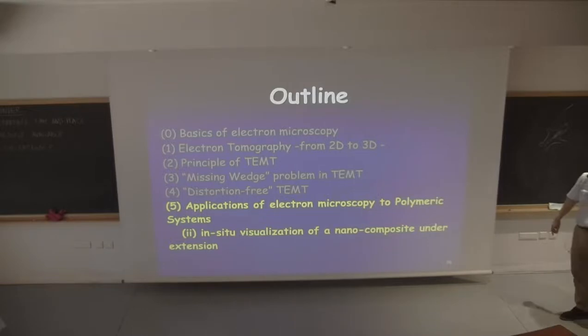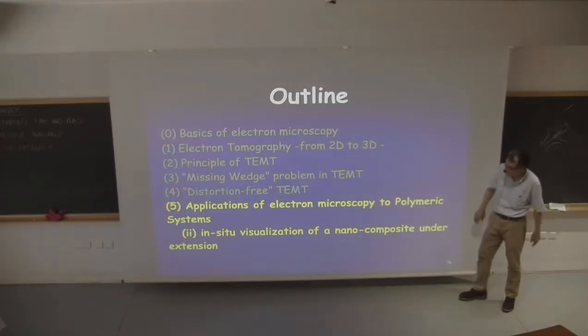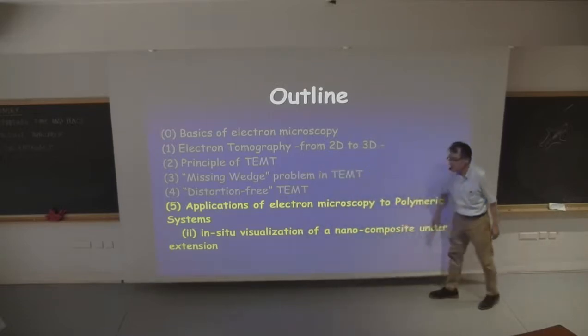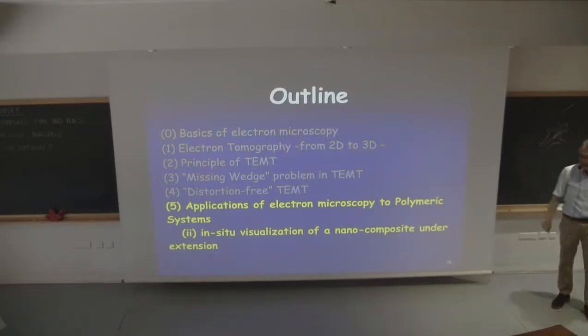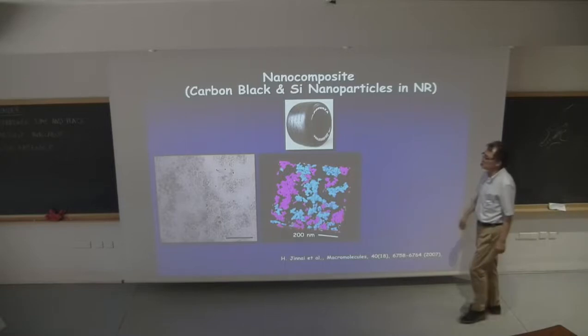So the next topic is not three-dimensional. That's going to be two-dimensional, okay? In situ visualization of nanocomposite under extension. So we stretch a sample and then visualize what happens. Why do we do this? We want to do this.